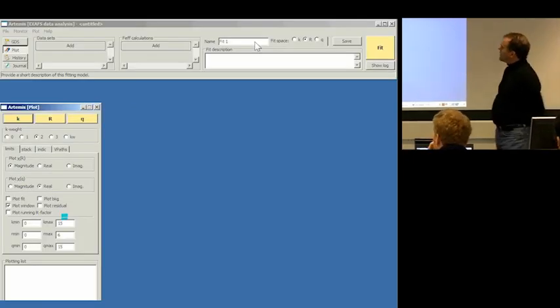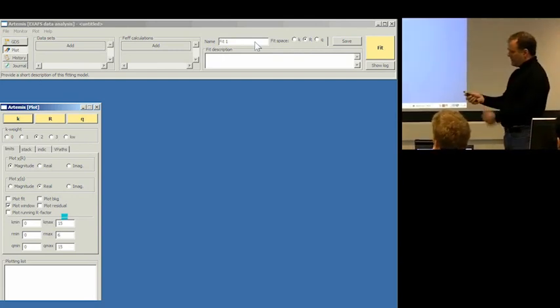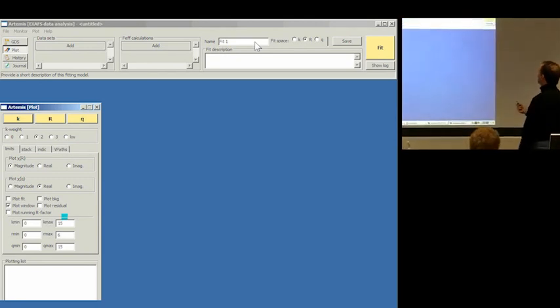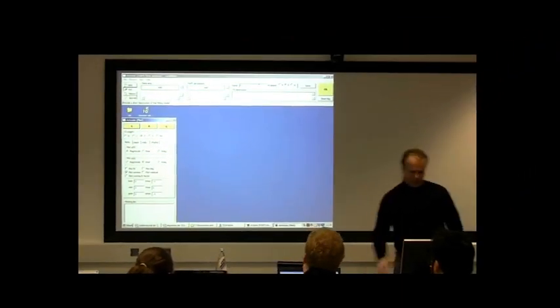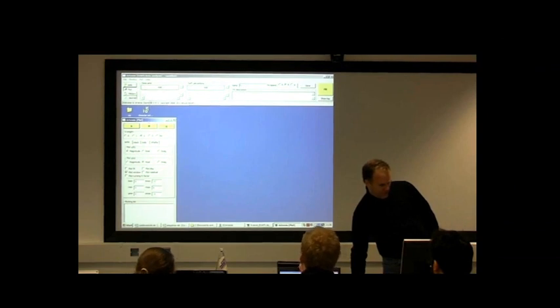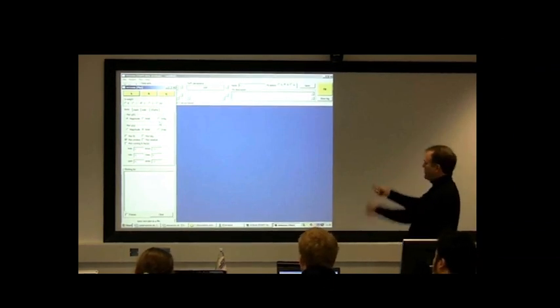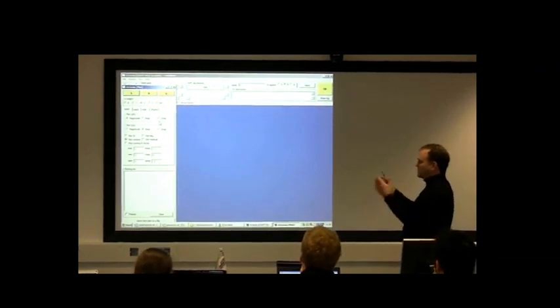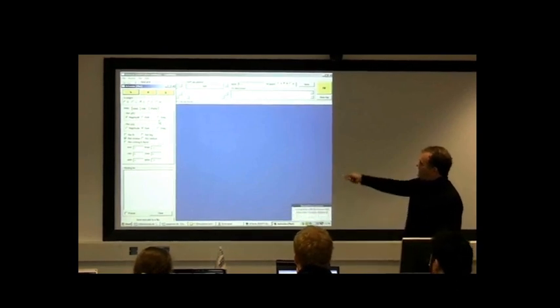So when Artemis starts up, two windows appear. The one at the top of the screen that goes across the whole top of the screen is sort of the master control panel, and everything starts from up here. This vertical window started off a little bit off screen, so I'll bring the whole thing up. This is a low resolution monitor, so Artemis works great on a really big screen, and there are a lot of windows that you have to dig through on a smaller screen like this, but we'll make do.